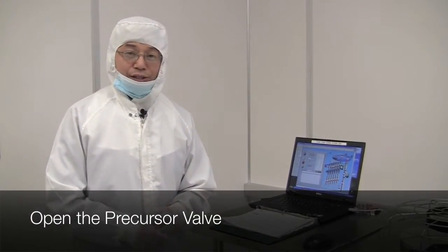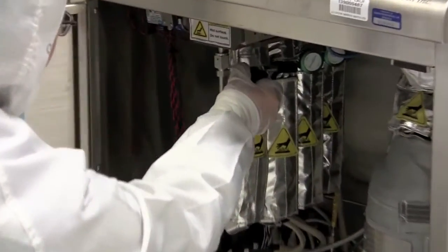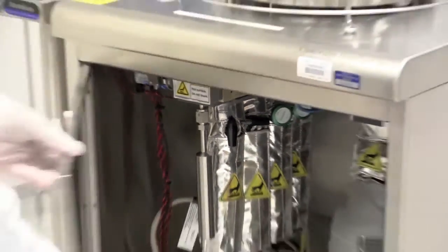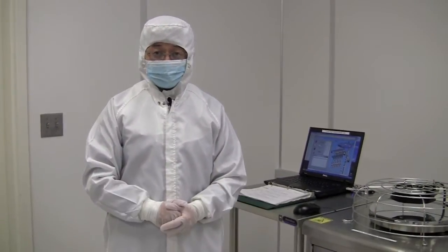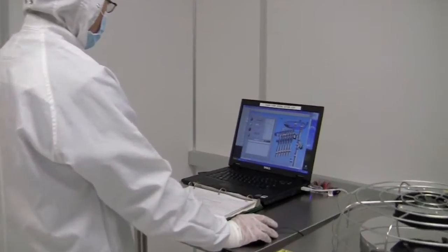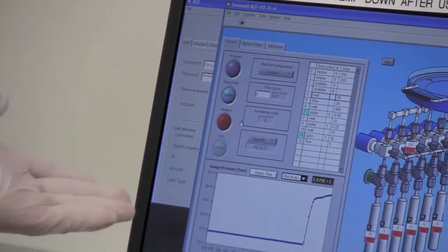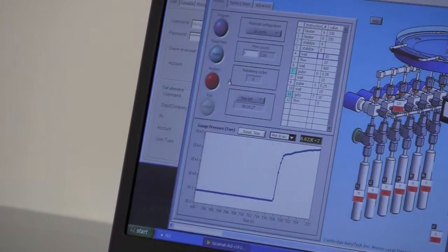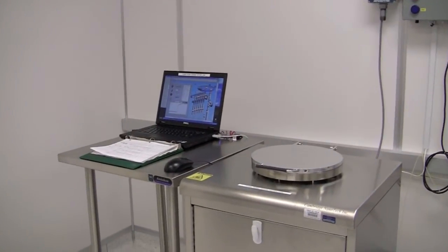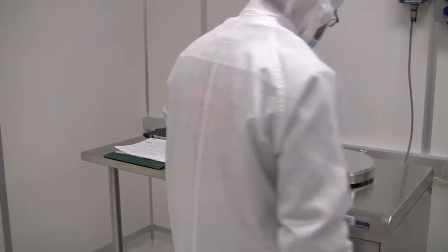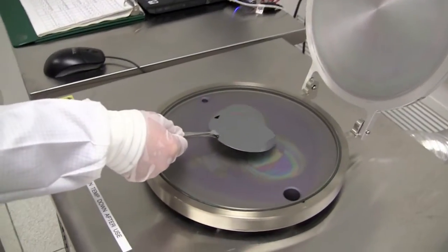Now the temperatures are up and the system is ready to run. So first, open the valve of the precursor bottle. Put on your mask in order to avoid the contamination of your wafer. Click the vent button. Now you see the button toggles to pump button and the pressure goes up and quickly goes to the atmosphere pressure. Put aside the metal shield and lift the lid. Put the wafer to the center of the chamber.